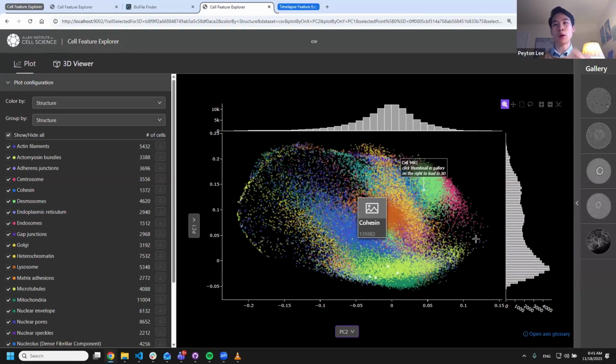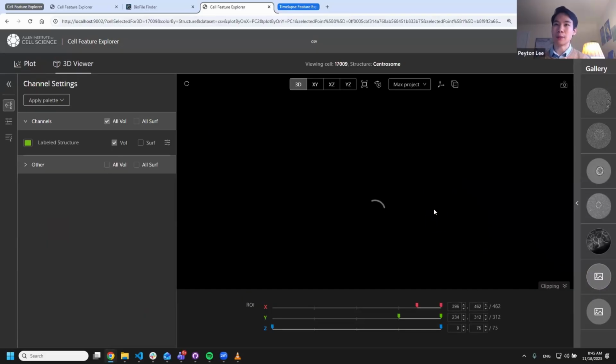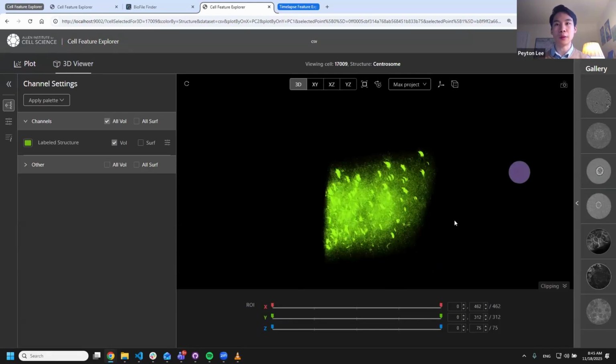And then if I'm really interested in what's happening in this corner, I can click into any of these cells to visualize them. So here, for example, this is, I think, just a crop of one of the images in the variance data set. We'll see if this loads or if I'm going to get demo luck. I'll try another image. Let's see if this one works. Oh, that one might have just loaded. There we go. So that's a smaller crop of the whole cell. And there's the whole volume.